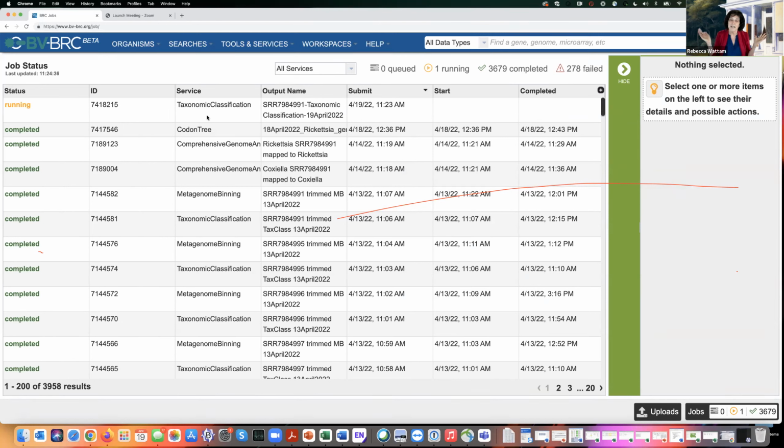Sorry about that, but that's the way it goes. So are you going to have to wait for this? No, we are not, because like a cooking show, I have run all of these things before, so we can look at them, and I've made them available for you as well.